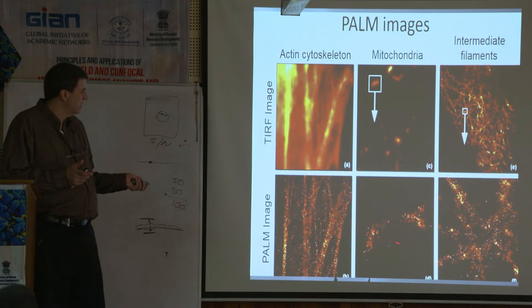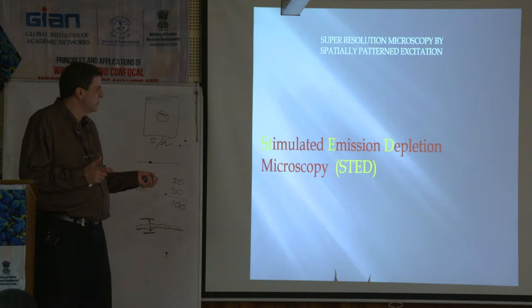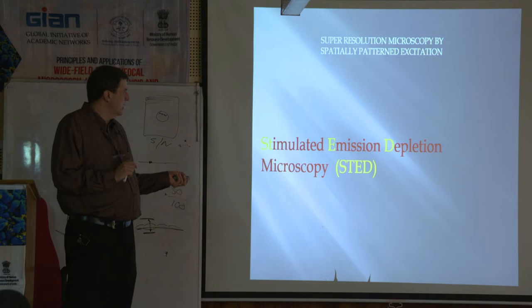Okay, so let's look at this one, STED. This is the one I've used before at the institution I'm at. We have STED. I've done STORM too, but not a whole lot. But this one, STED, and the one I use is Leica. It's a Leica microscope with STED.